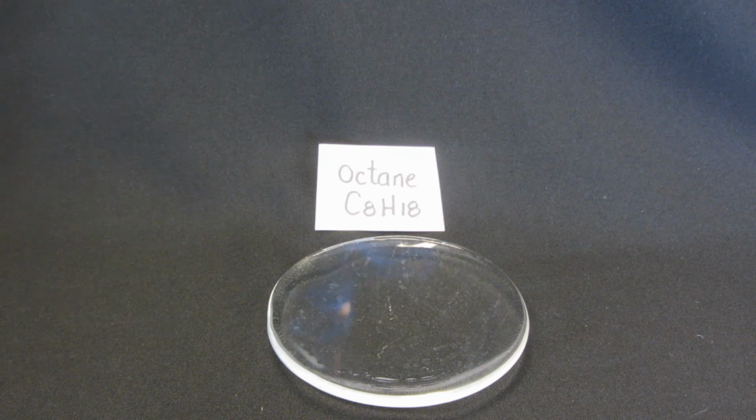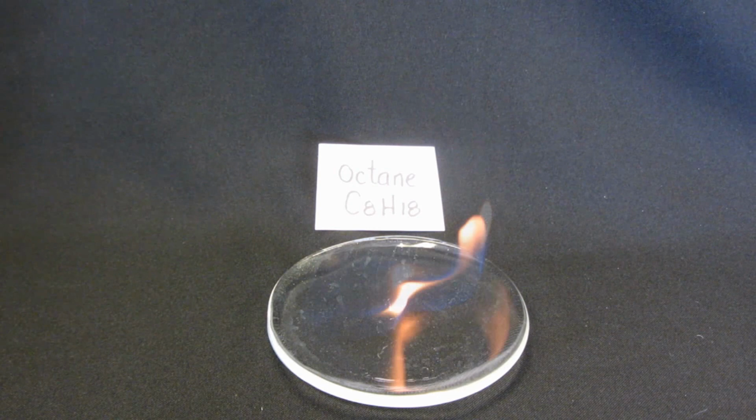Now that we see it burning, you can see an incandescence, which indicates it doesn't burn as cleanly as methanol. The orange incandescence is the result of unburned carbon particles that are glowing in the flame, and for that reason octane may burn cleanly in an internal combustion engine, but is not nearly as well suited for use in an open flame or an alcohol lamp.